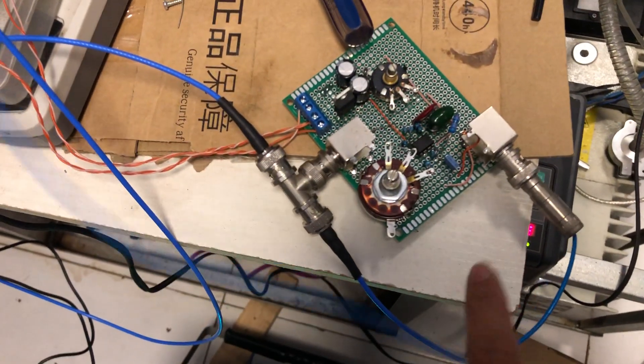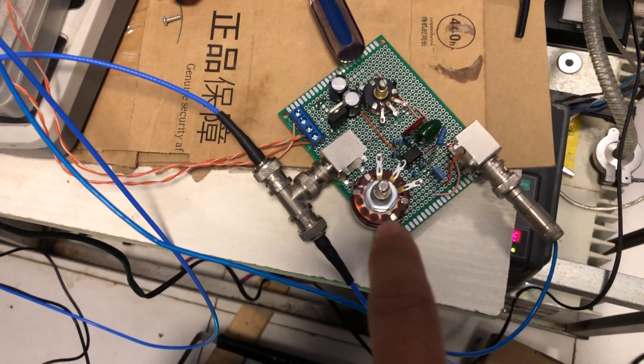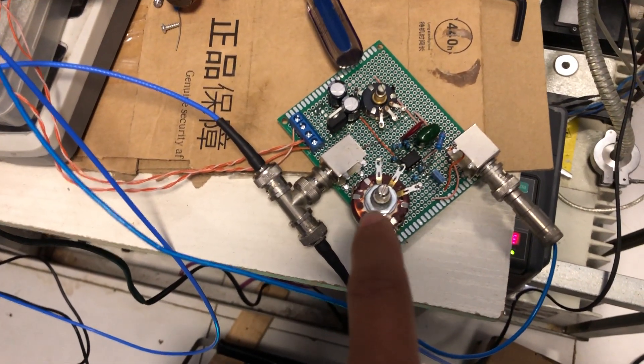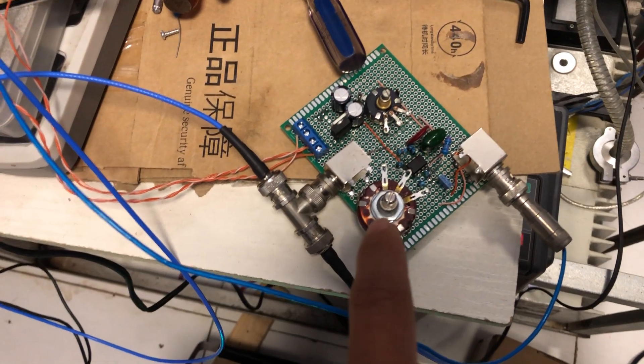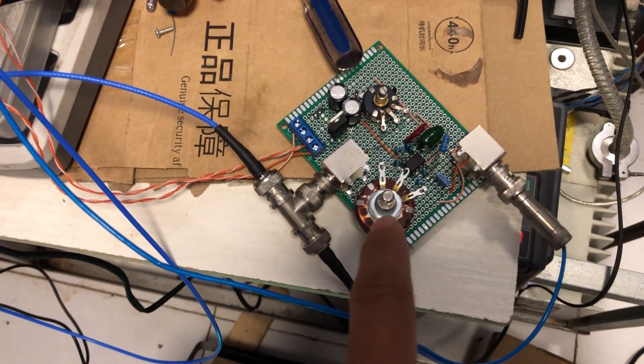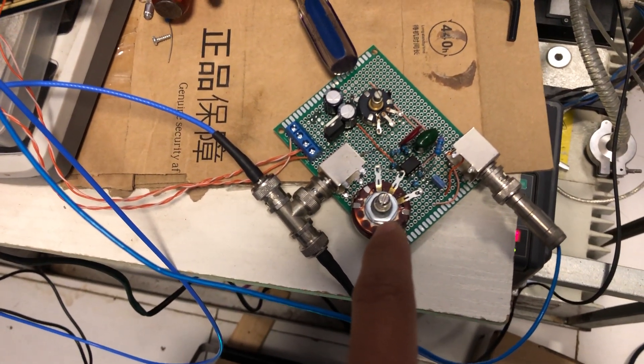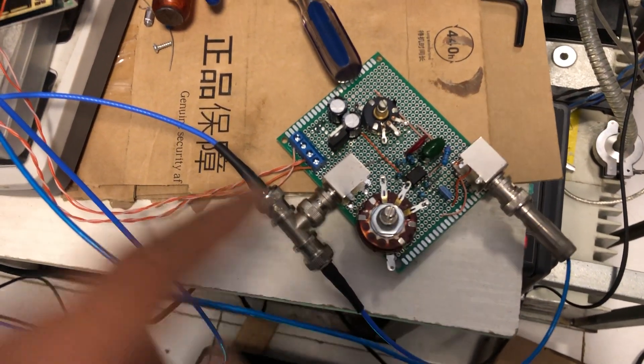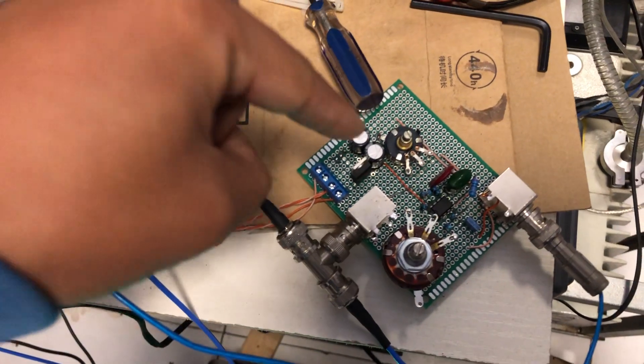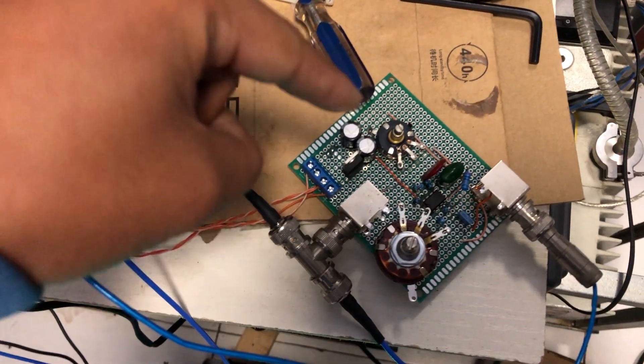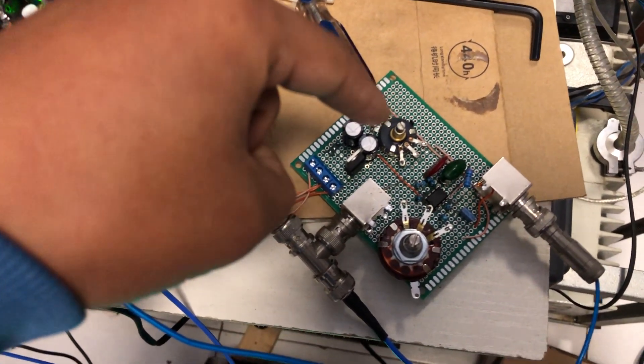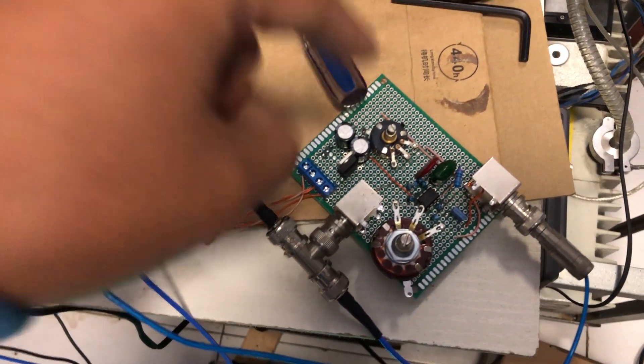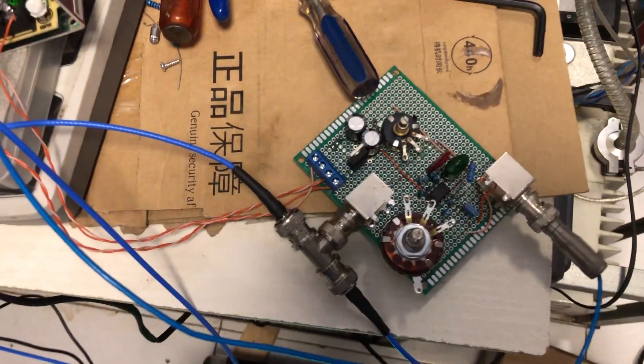And here is the gain control that controls the contrast. Here is the offset control that controls the brightness on the screen.